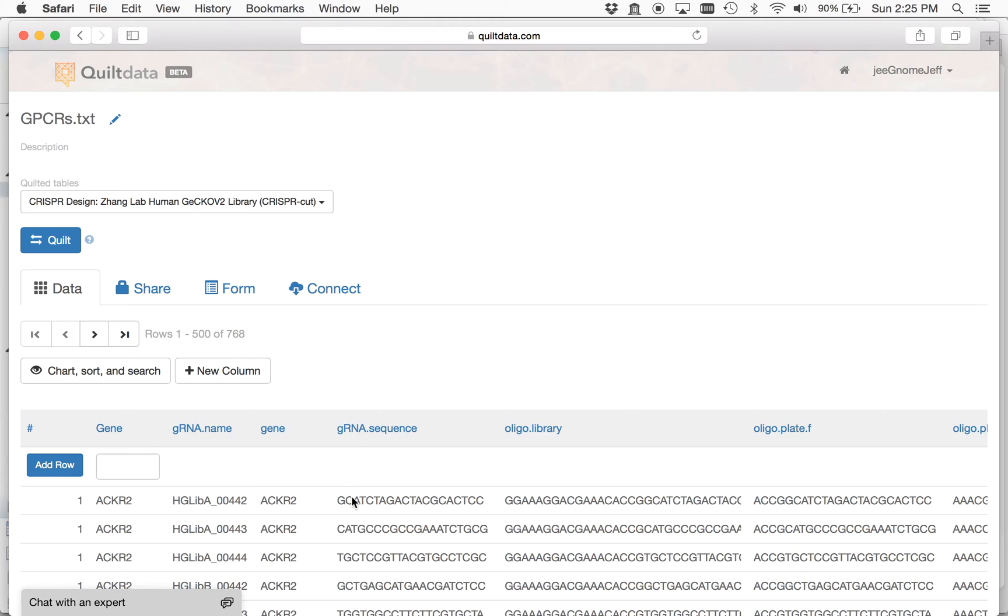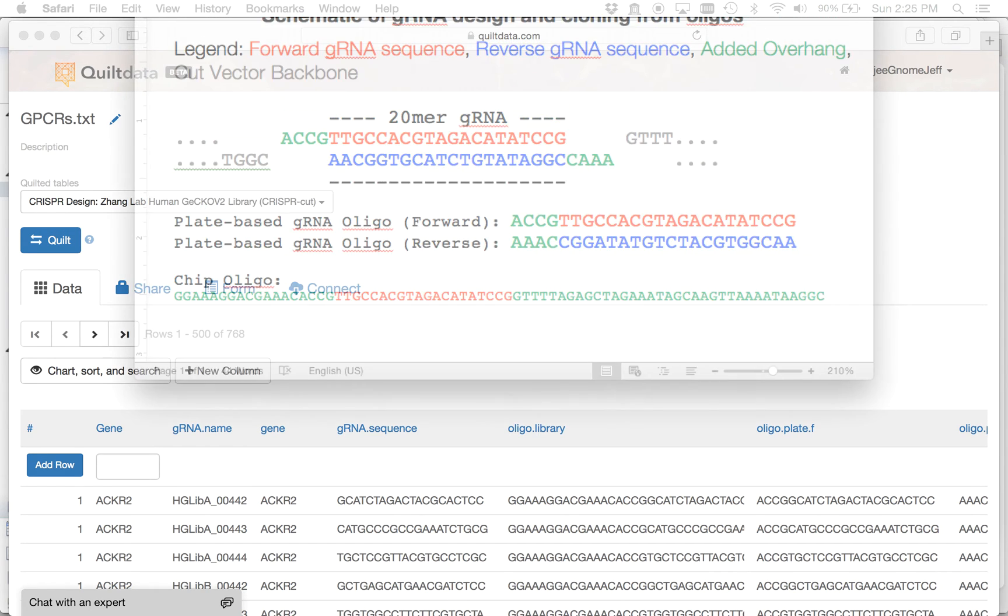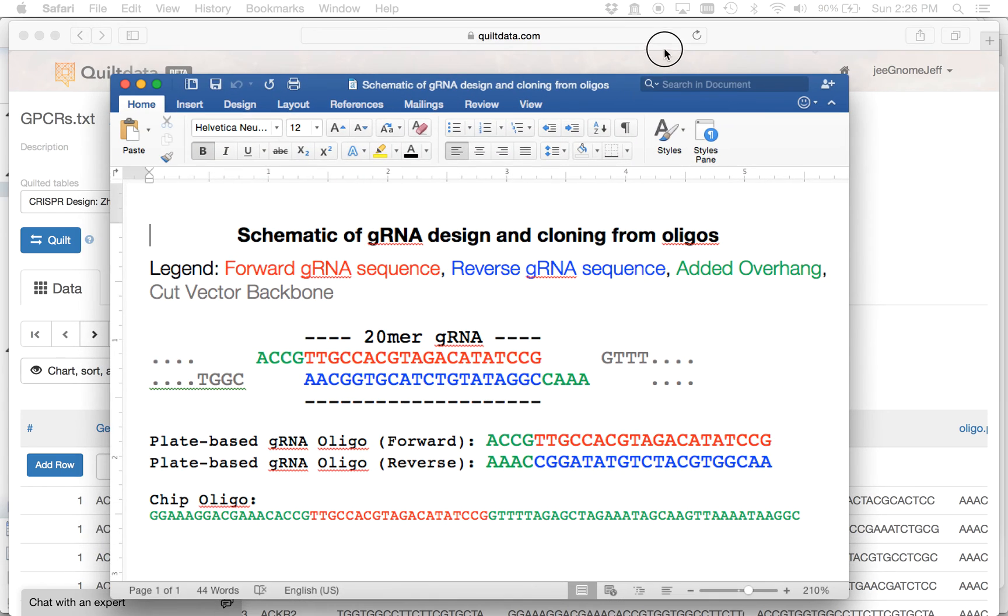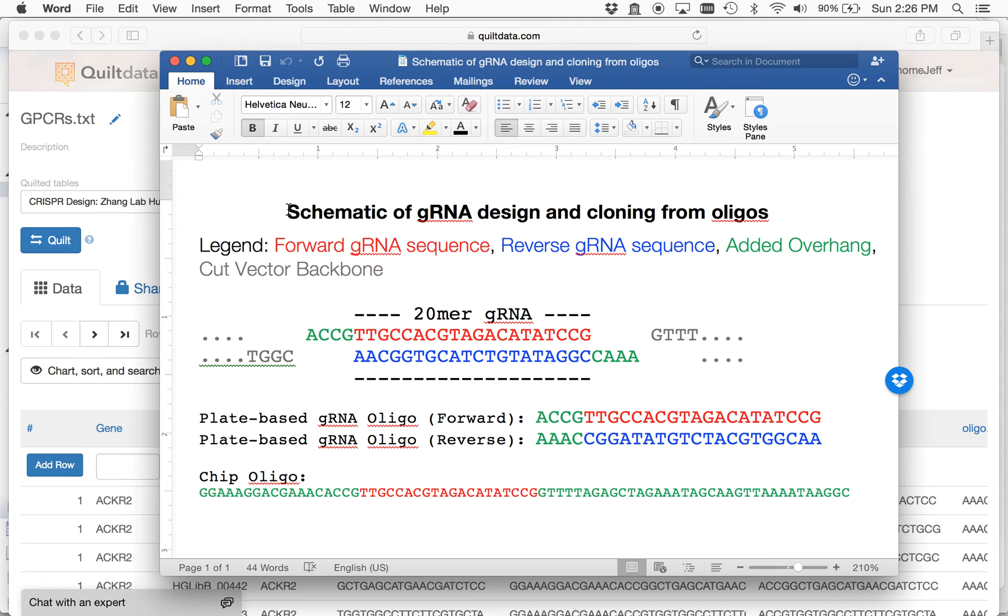And then you'll have the guide RNA sequence here, this is a 20mer, but then over here you'll have other sequences that are targeted towards the actual cloning process of making this library. So this goes into a little bit more detail here.